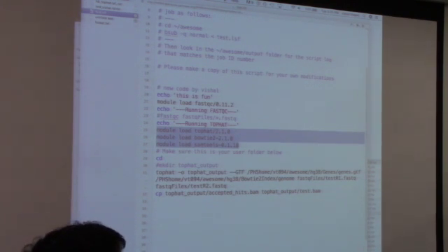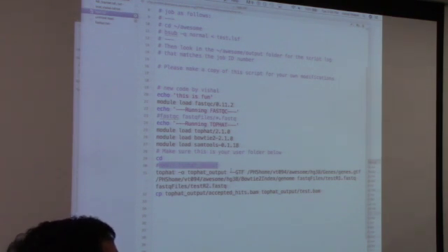Vishal, how did you comment out the make directory? That actually is to be uncommented. Actually no, it's not to be uncommented. You do this before you run the job. You can do it independently, in your own directory. One other thing, guys: I've commented this part out because you don't need to create it every time when you're running multiple samples. But the first time you run this, just make sure you create a TopHat output directory.